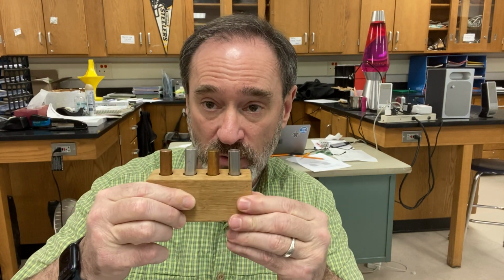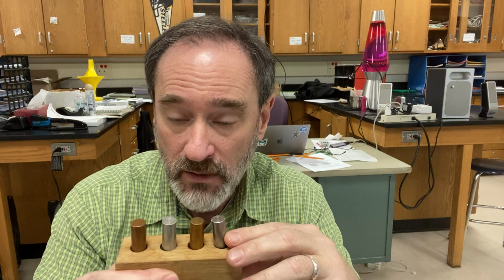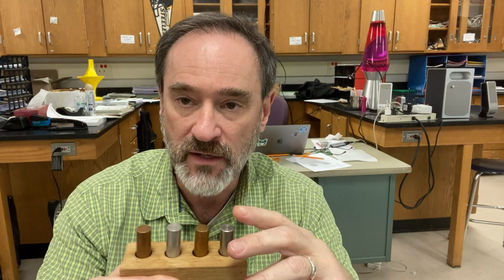So this lab is about density, and I'm going to find the density of these 4 rods, and we're going to use the displacement method to find the volume, and we're going to use a scale to find the mass. And I've got water in a graduated cylinder, so why don't we just get started?